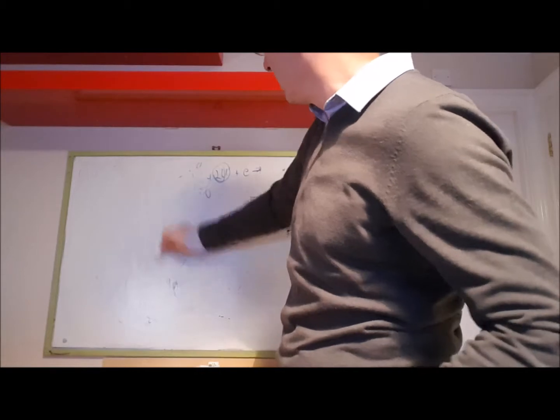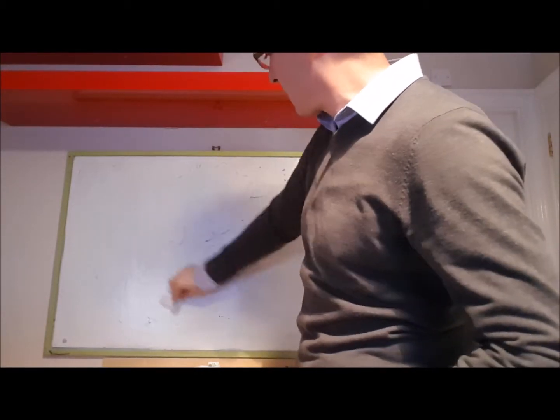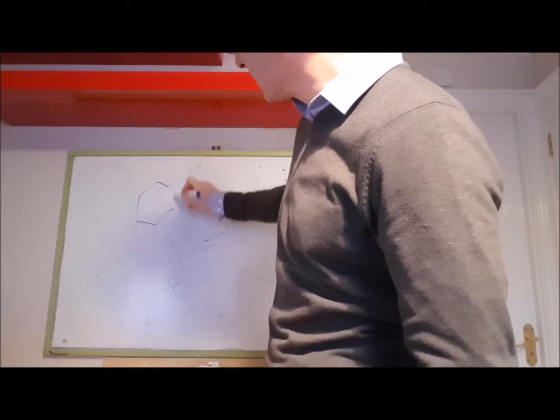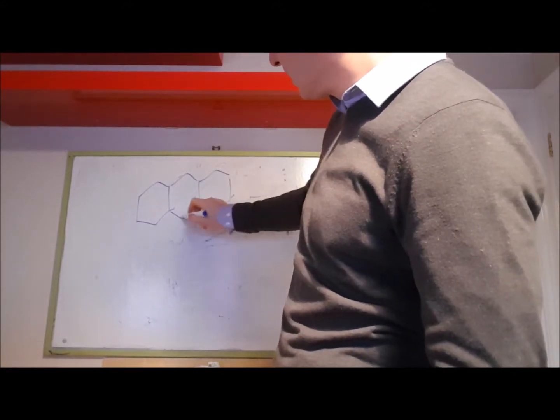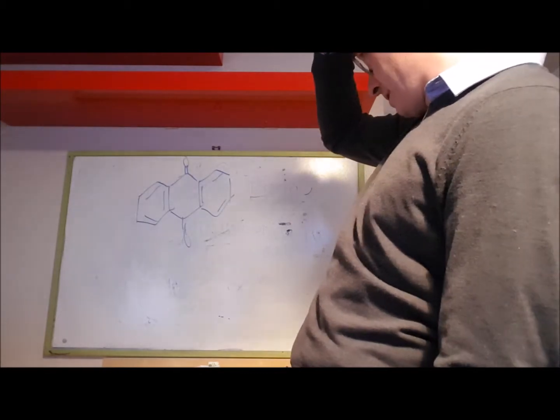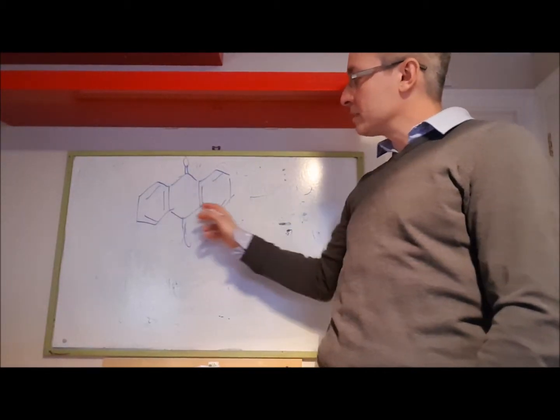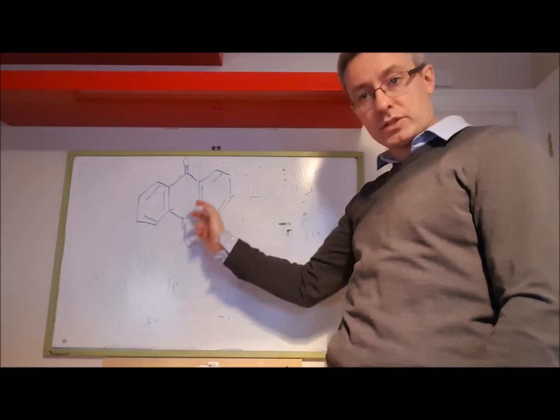I would cast this molecule down onto the surface. So if you don't think there's enough of these molecules on the surface, I would cast this guy down. I think that's anthraquinone. Anthraquinone. So it will likely adsorb well onto the surface of the carbon.